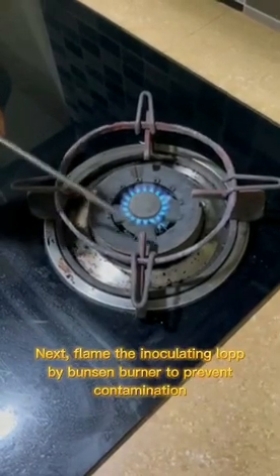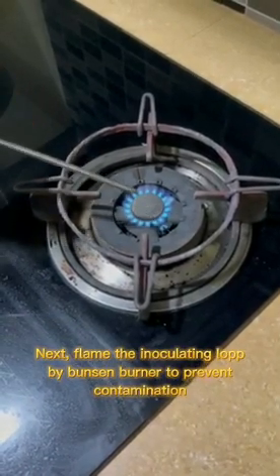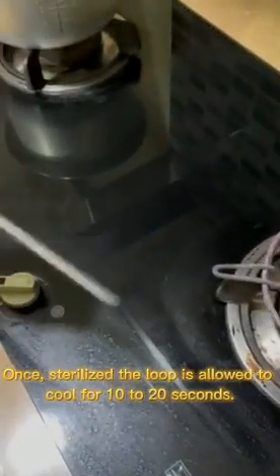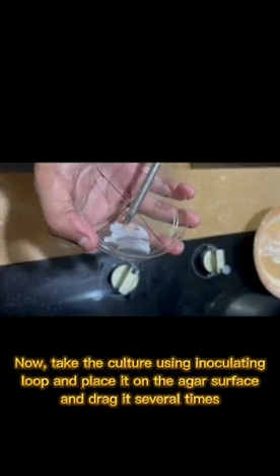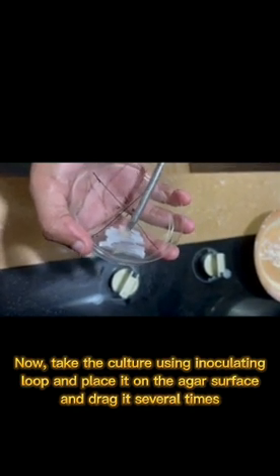Next, flame the inoculating loop by Bunsen burner to prevent contamination. Once sterilized, the loop is allowed to cool for 10 seconds. Now take the culture and place it on the agar surface and drag it several times.